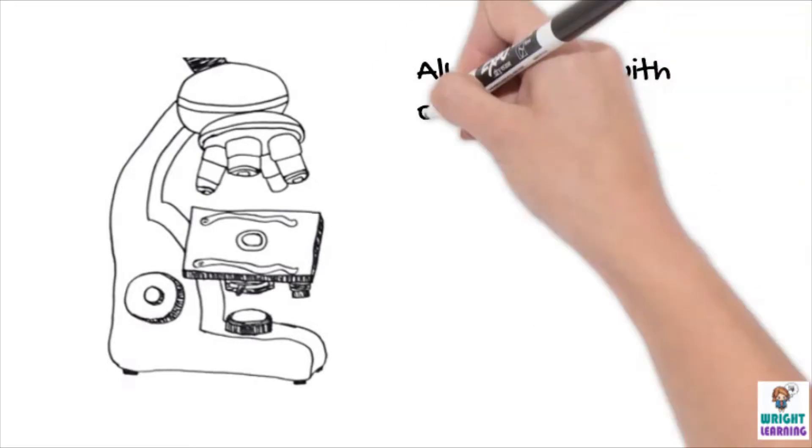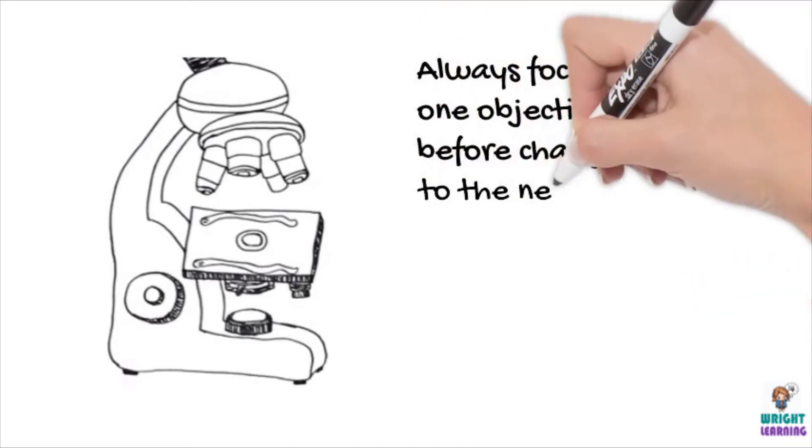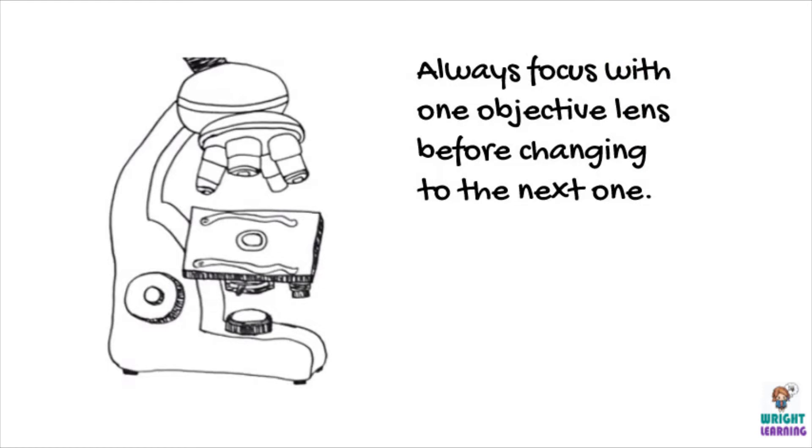If you want to increase the magnification, use the revolving nosepiece to set the next more powerful objective lens in place. Only ever increase the magnification level by one objective lens at a time. Make sure you focus with that objective lens first, before moving on to the next one. Otherwise focusing can become really difficult.